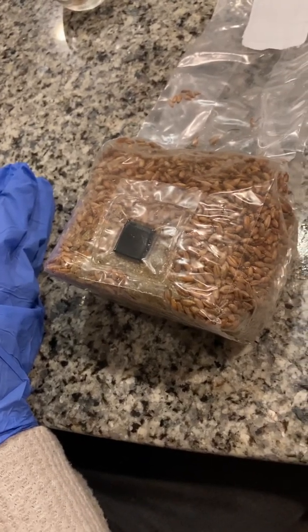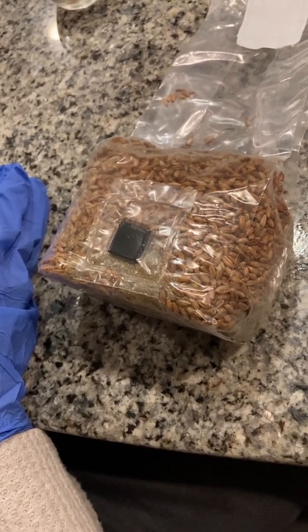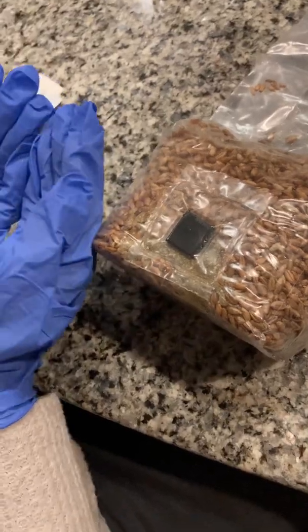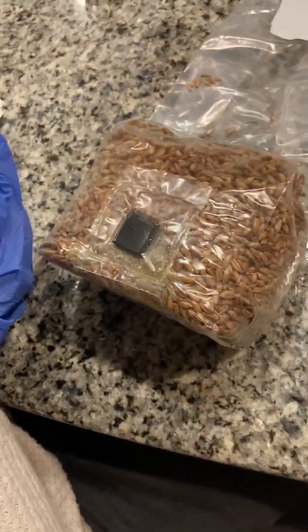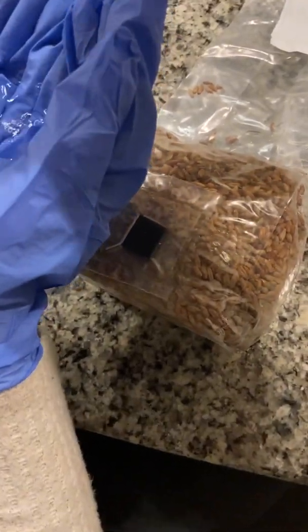We are going to have a tutorial on how to inject a grain spawn bag. These bags are from sgmlabs.com. First thing you want to do is put on some gloves, and then sterilize the gloves by pouring alcohol and wiping down your hands.